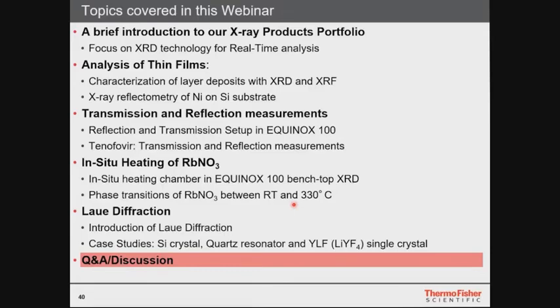If you want to orient a crystal to cut it in the right direction for some experiments, like some exotic magnetic properties or whatever, then Laue diffraction will be very helpful and it will help you to get your job done, and powder diffraction will be of absolutely no help. So it really absolutely depends on the application.